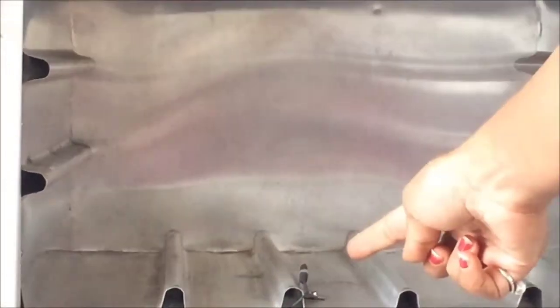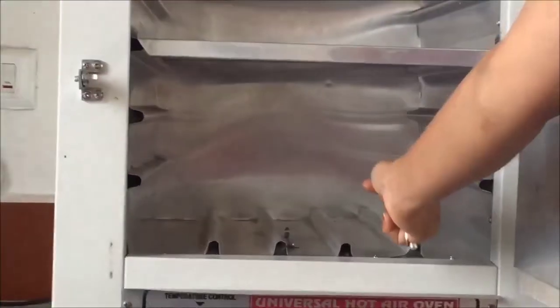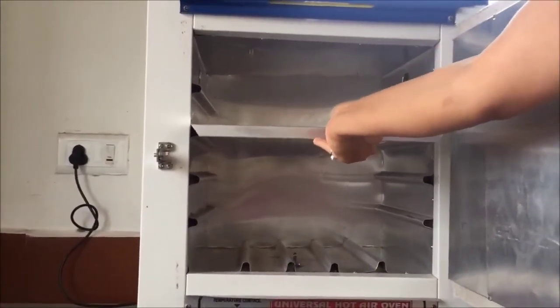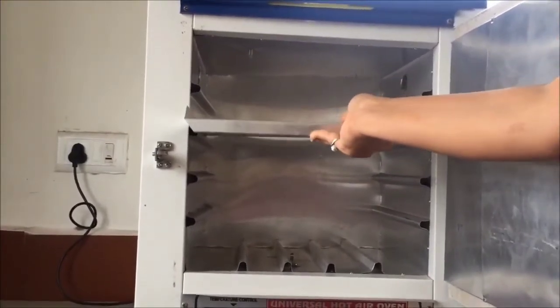At the bottom of the hot air oven you can see there is a plate-like substance — this is called the thermostat. The thermostat is a device which controls the temperature by maintaining it. If the temperature exceeds the set point, it will auto cut-off, and if the temperature decreases, it will restart.